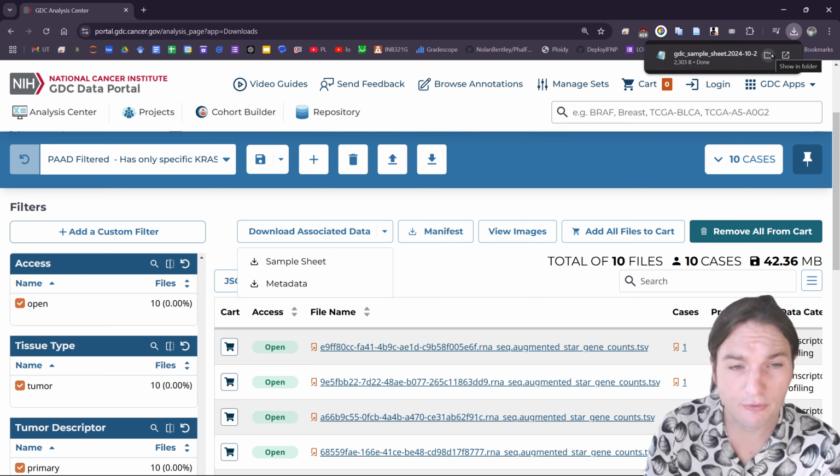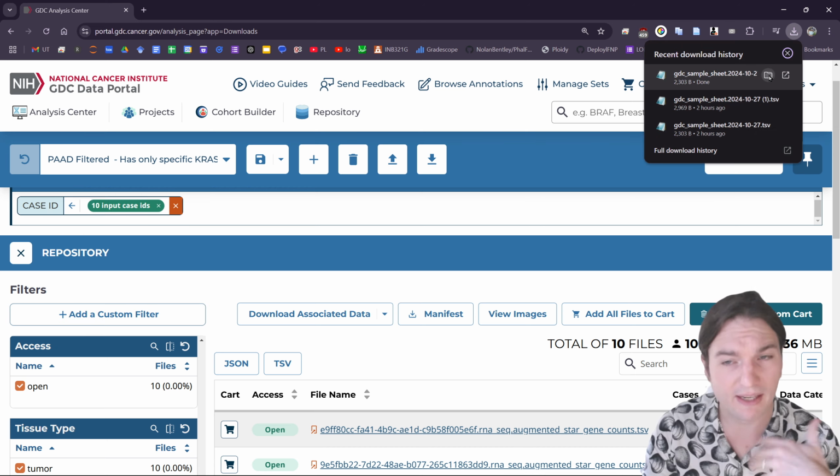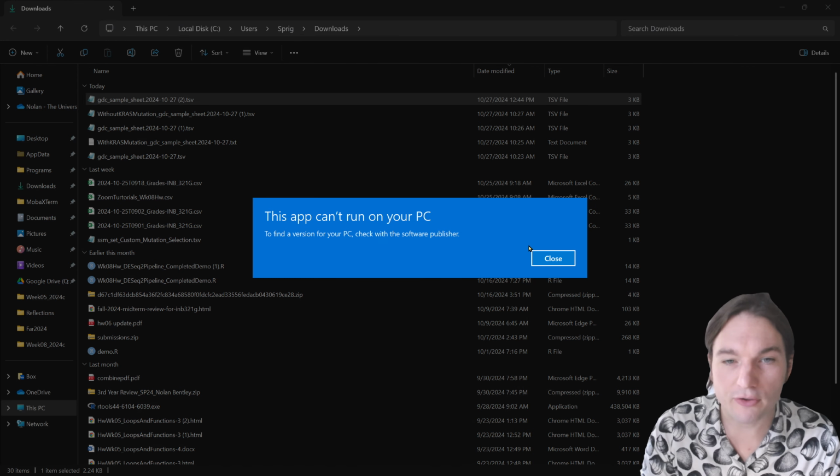So you can see I've already done this before. I can then repeat that process, but actually before I repeat that, I should go save that. Make sure I give it a good name. I could edit it with Notepad, or I could open it with a particular program, like Microsoft Excel. I don't want to have to navigate to Excel on my own on the video.